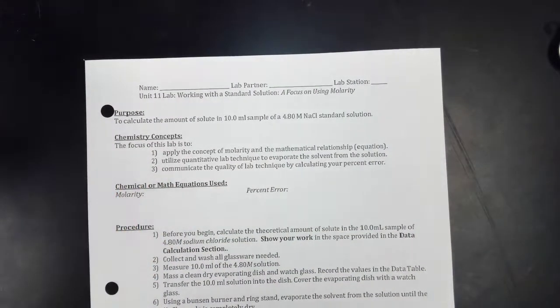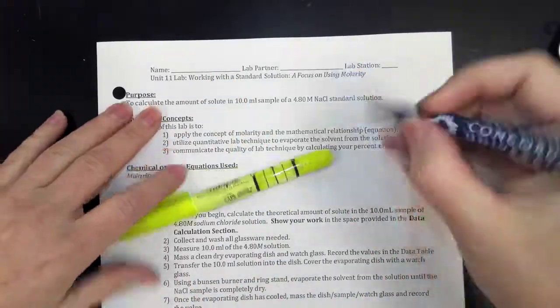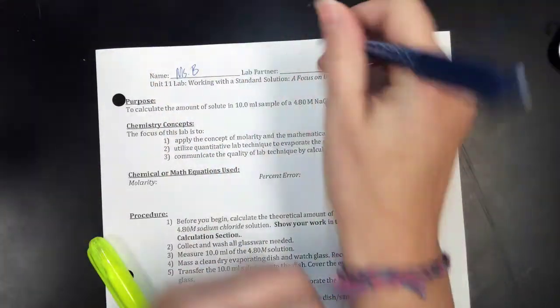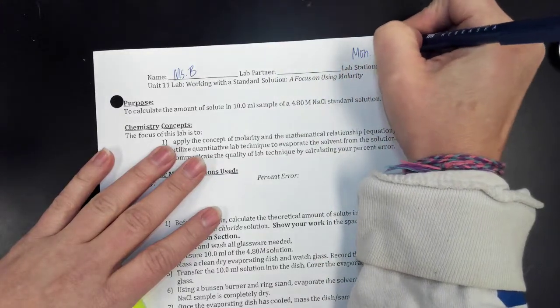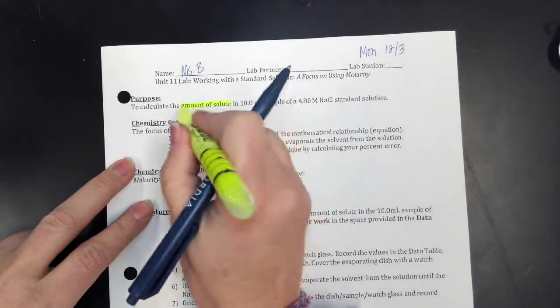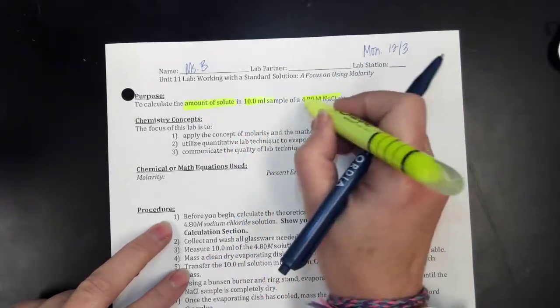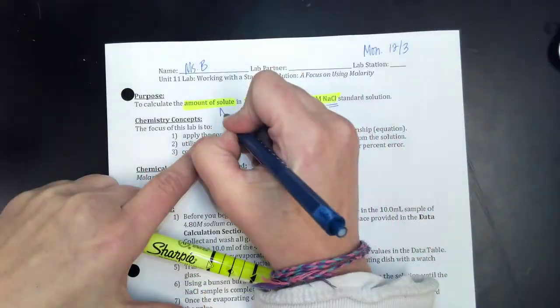So on your way in, you received your lab protocol, and today we're going to practice working with the molarity equation. So bring this out. I have my highlighter, I have a pencil, and let's pre-lab this. So it is lab partner. Write down your lab partner's name. I'm working by myself. It's Monday, December 3rd. The purpose is to calculate the amount of solute in a 10 milliliter sample of a 4.80 molar sodium chloride solution. So my solute is sodium chloride.